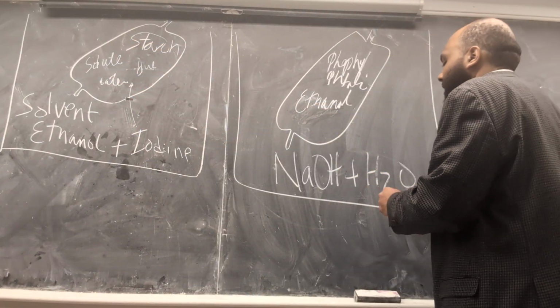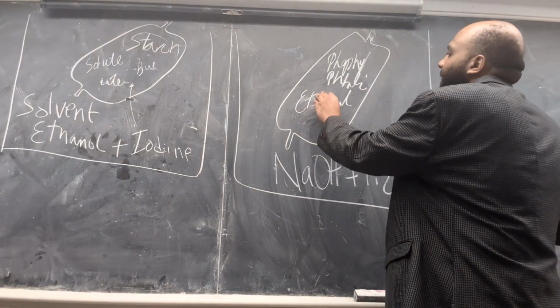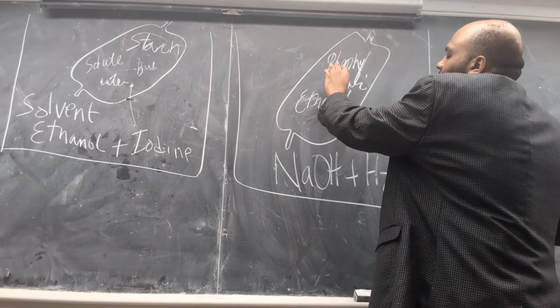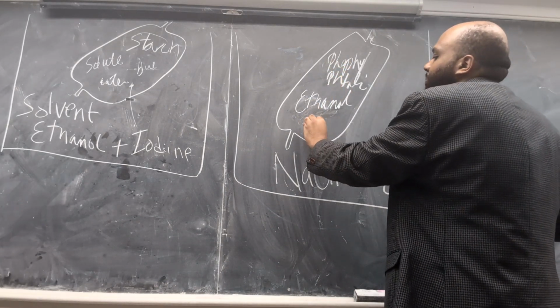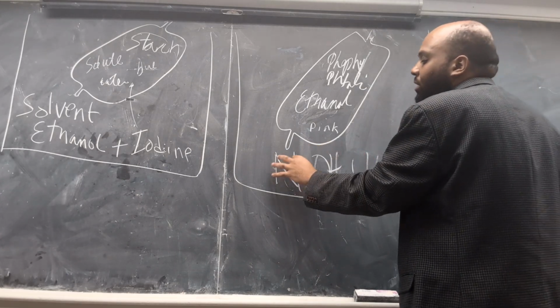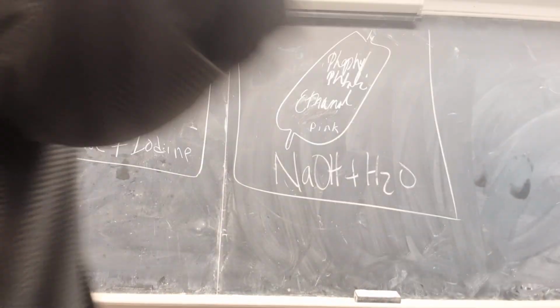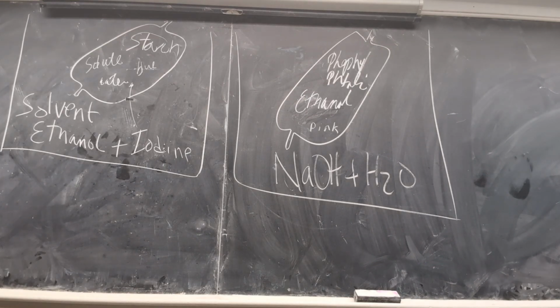And here, the sodium hydroxide is going to go inside and interact with the phenolphthalein, and that's going to turn pink, showing you that the water or the solvent went from an area of a high concentration to an area of a low concentration. So, every group, please make sure you rinse out your beaker.